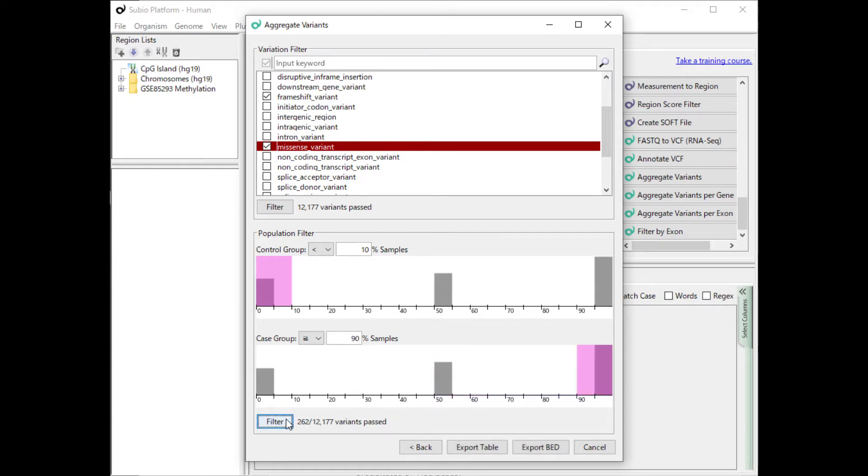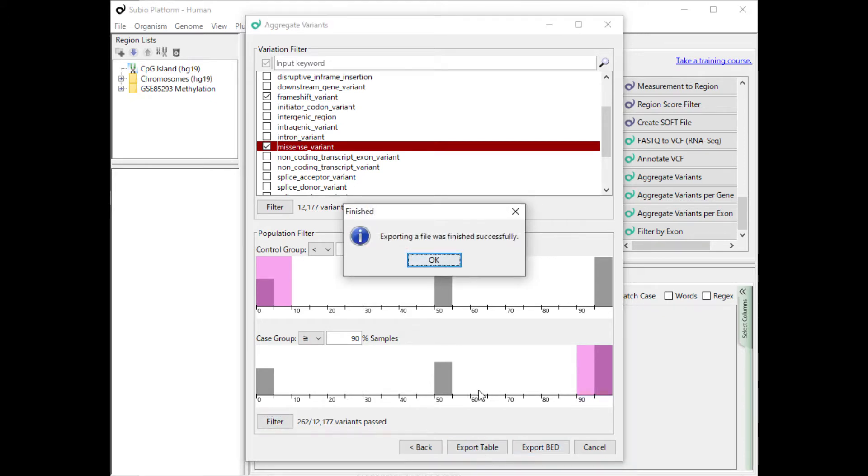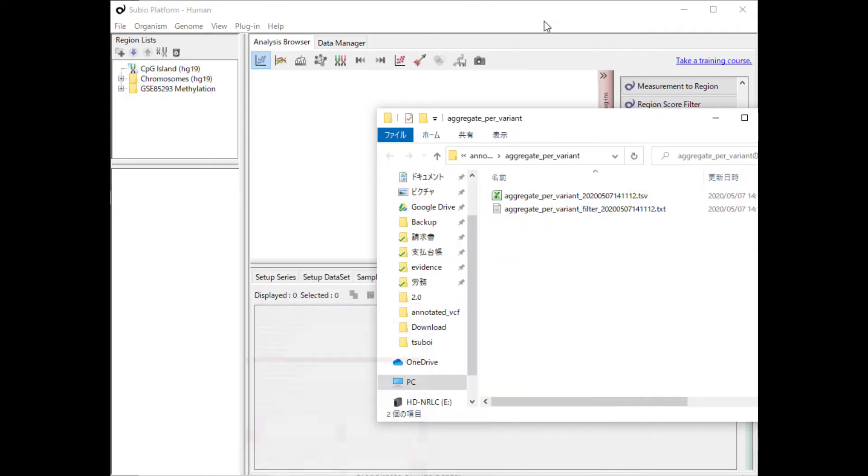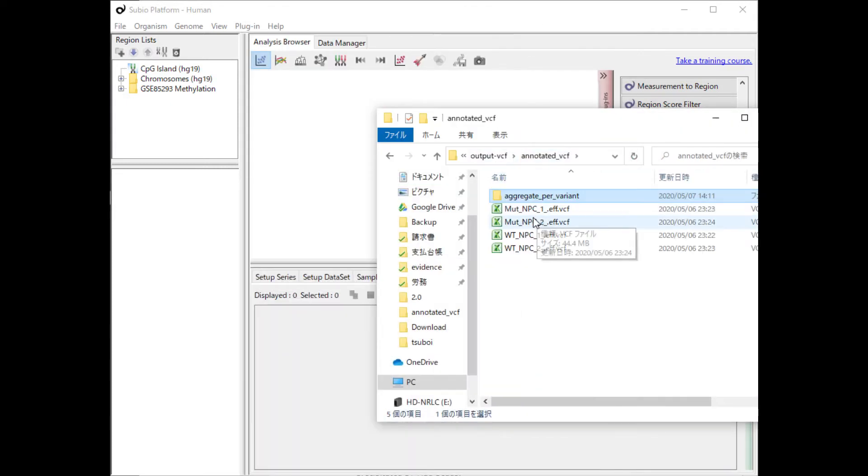Let's extract mutations that are not in control group, but are always in case group. There are two buttons to output the results, the Export Table and the Export Bed. First, press the Export Table button.